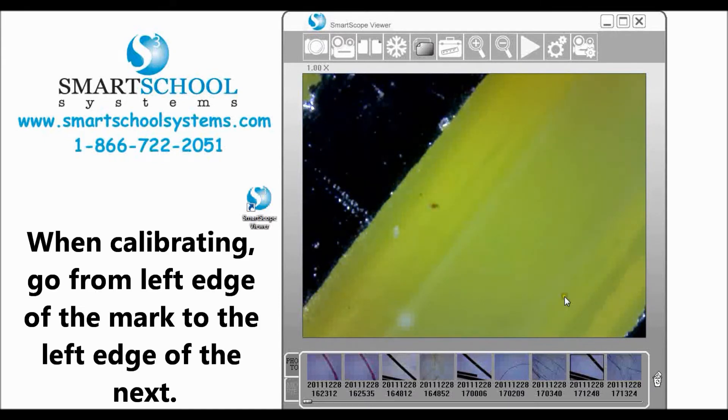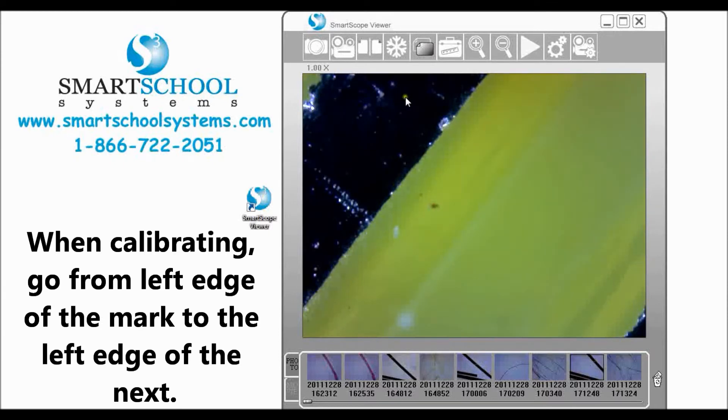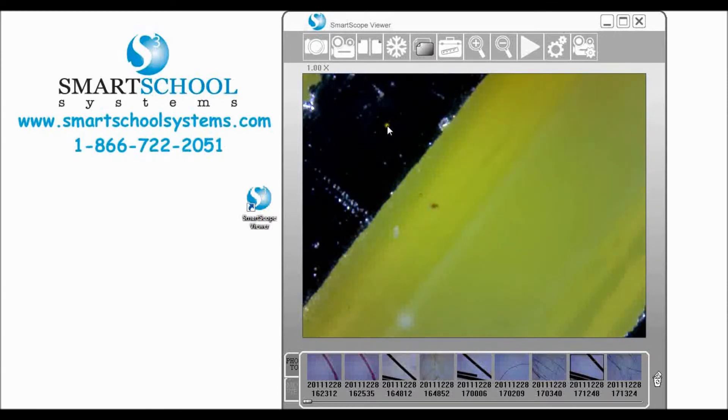Now I'm using the SmartScope 500 for our purpose today. You could use the traditional SmartScope or the SmartScope 500 either one, the process is the same.